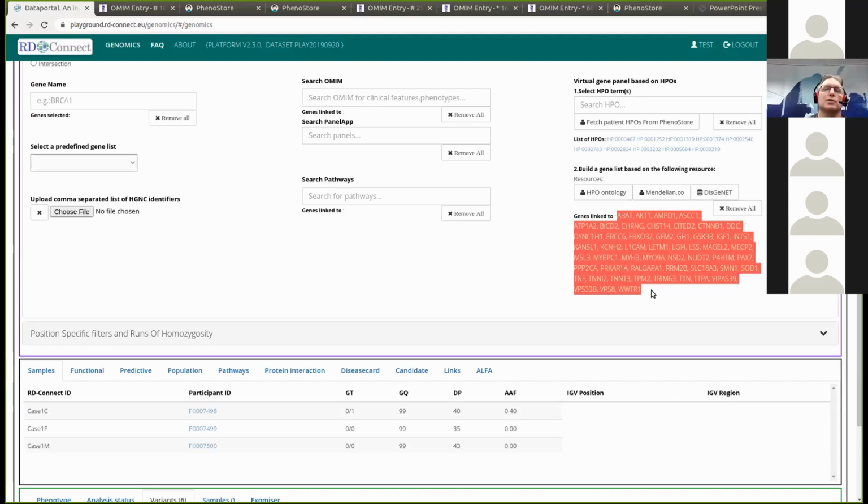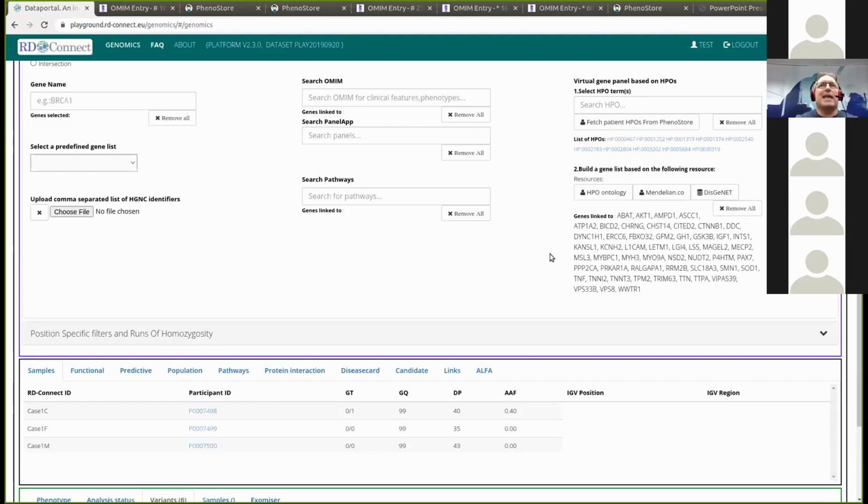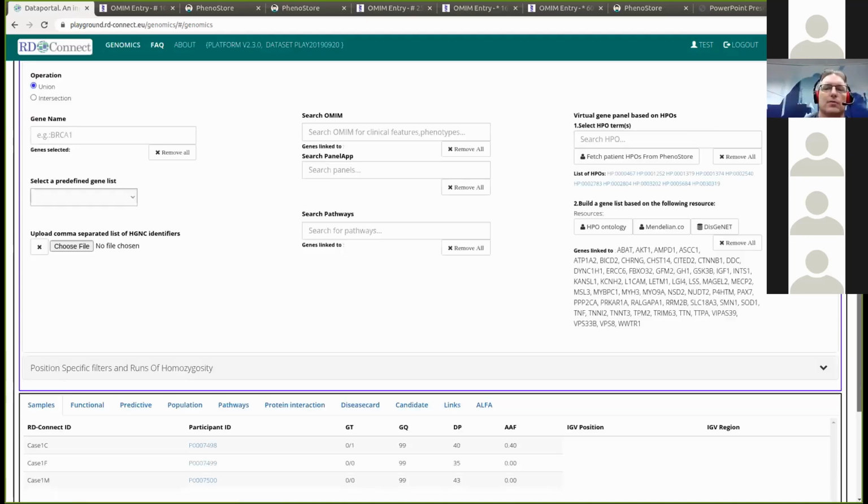Whereas using the HPO, we're bringing in everything, being very sensitive, but sometimes getting too many results.